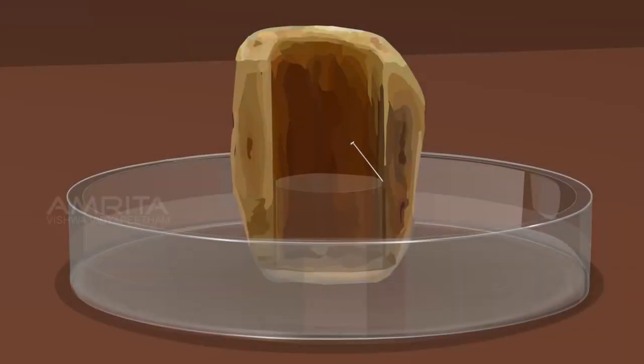Observation. The level of sugar solution in the potato cavity rises after some time due to the entry of water into the sugar solution through selectively permeable membrane of the cells of the potato.